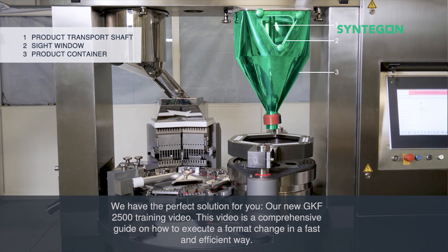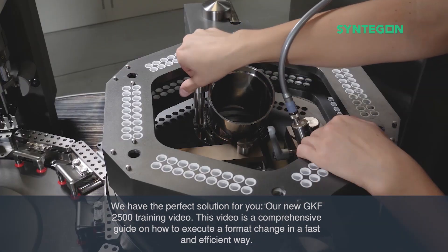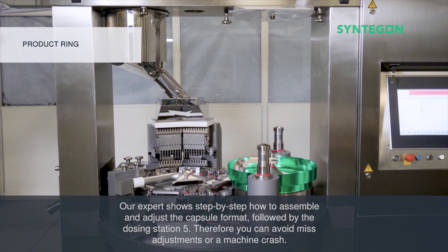Our new GKF2500 training video is a comprehensive guide on how to execute a format change in a fast and efficient way. Our expert shows step-by-step how to assemble and adjust the capsule format, followed by the dosing station 5. Therefore you can avoid misadjustments or a machine crash.